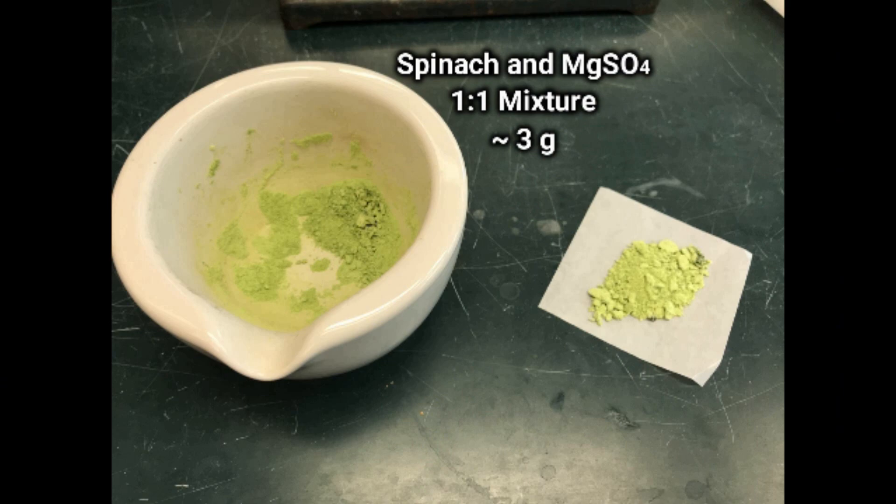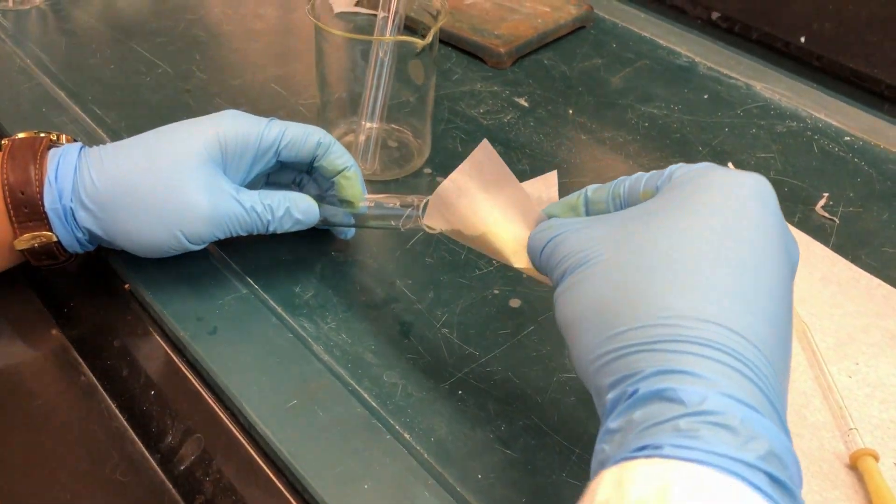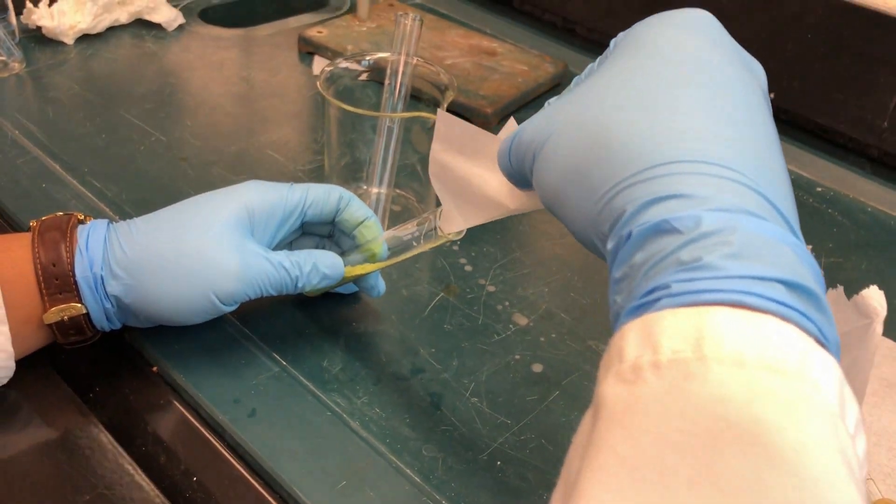Next, weigh about 3 grams of the spinach mixture and carefully add it to a test tube. You can use a spatula or make a funnel from the weighing paper.